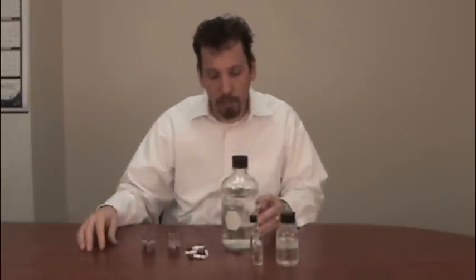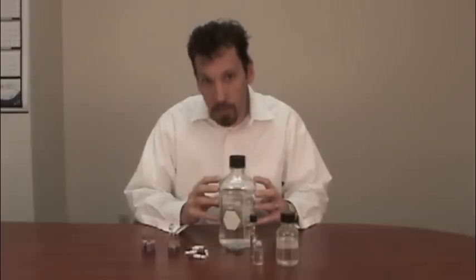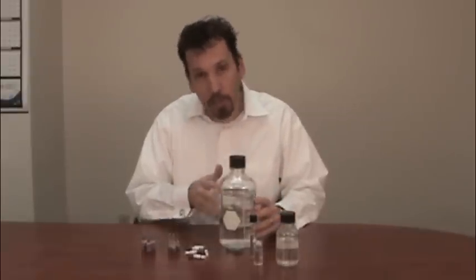In a steam sterilizer, if we're sterilizing solid items — equipment, laboratory equipment, glassware and whatnot — steam will come in direct contact with the surfaces of the items we're trying to sterilize. The same is not true when we're trying to sterilize liquid in a container. In this case, the steam from the autoclave will contact the container and it will condense, and it's that condensation where you get the transfer of thermal energy from the steam molecules to the glass surface.